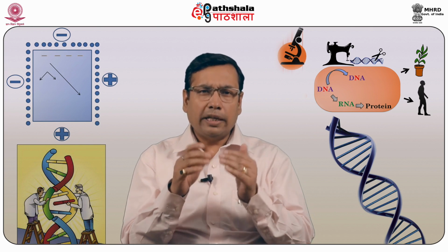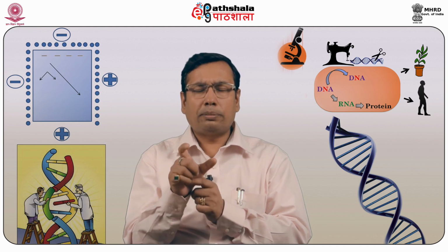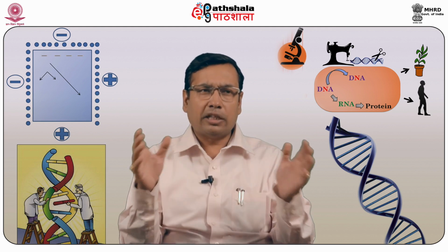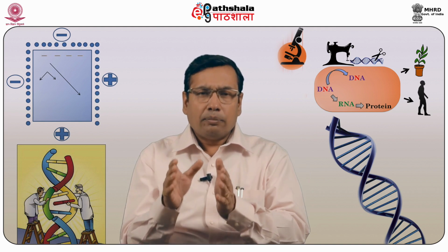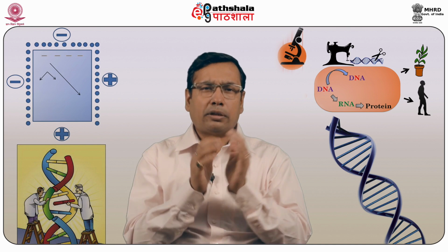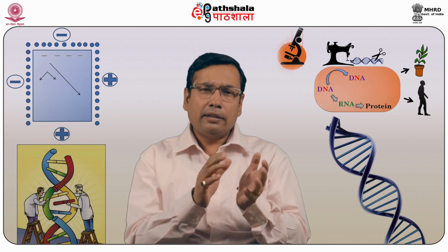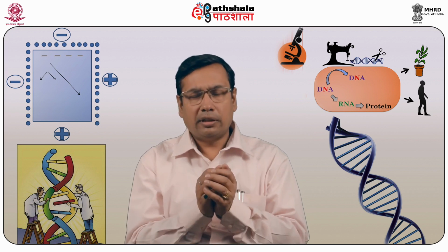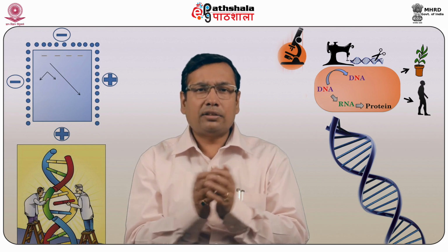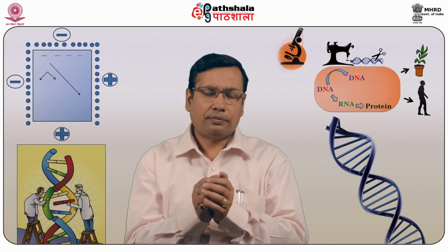So scientists were thinking that during these 5 minutes or 4 minutes of denaturation, or sometimes 10 minutes of denaturation in case of genomic DNA, the Taq polymerase is doing nothing but only sitting there. So they thought that might reduce the efficacy of Taq polymerase, and that is why they started the concept of hot start PCR.